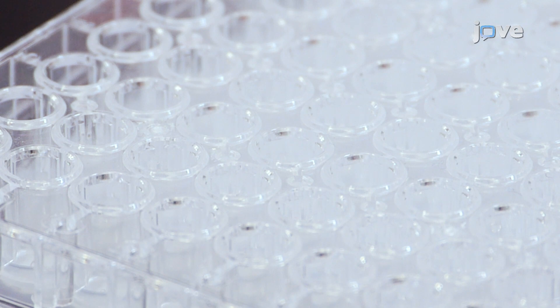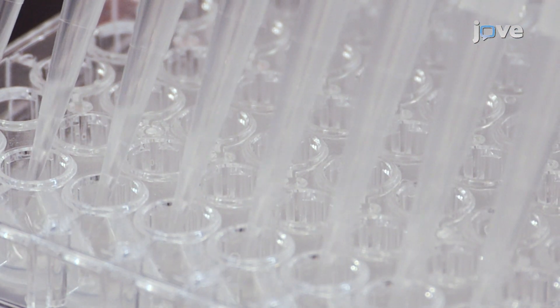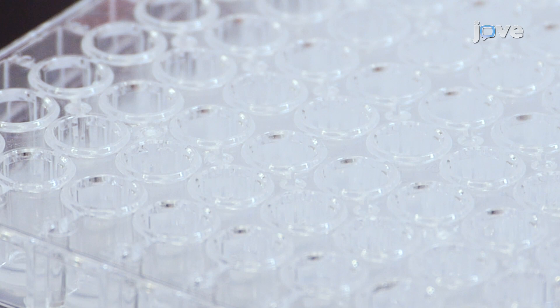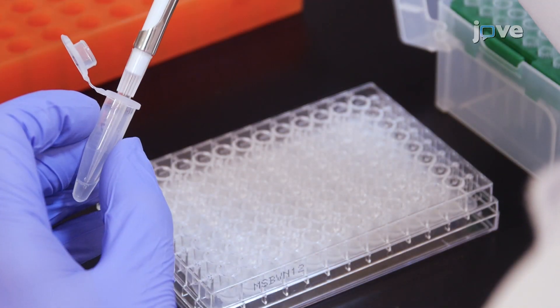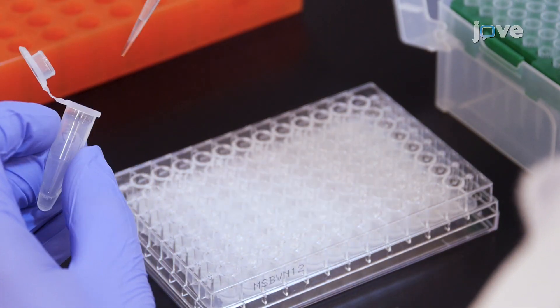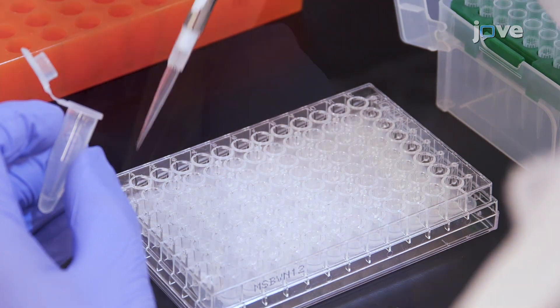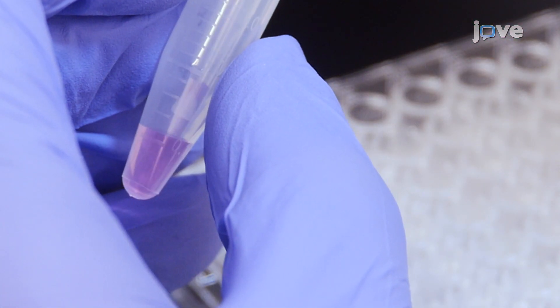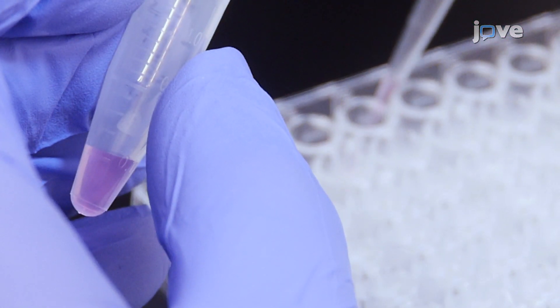For cell culture supernatant samples, add 25 microliters of assay buffer to all wells. Add 25 microliters of each standard to the standard wells. Finally, add 25 microliters of each sample to the sample wells.